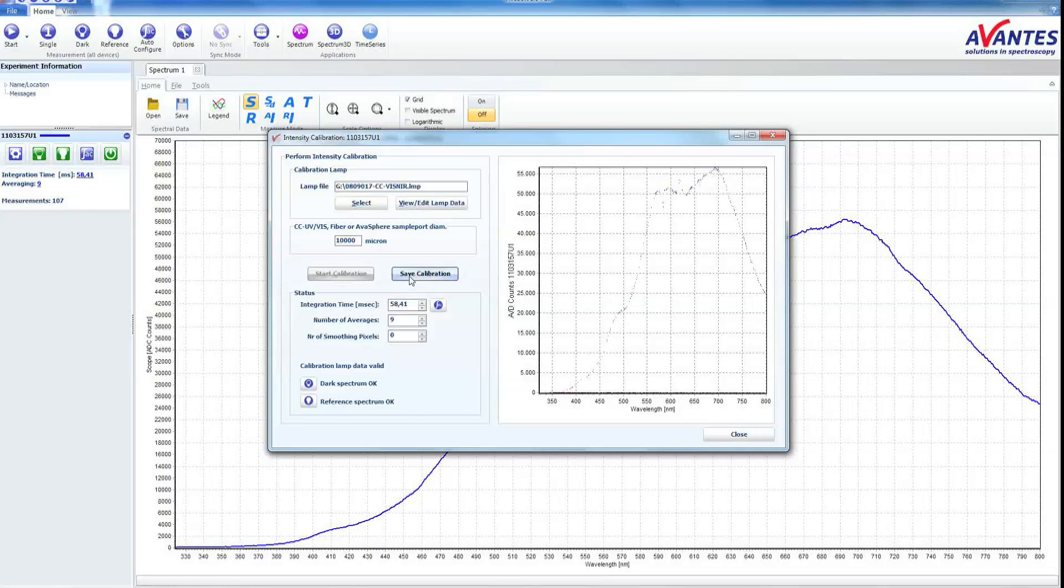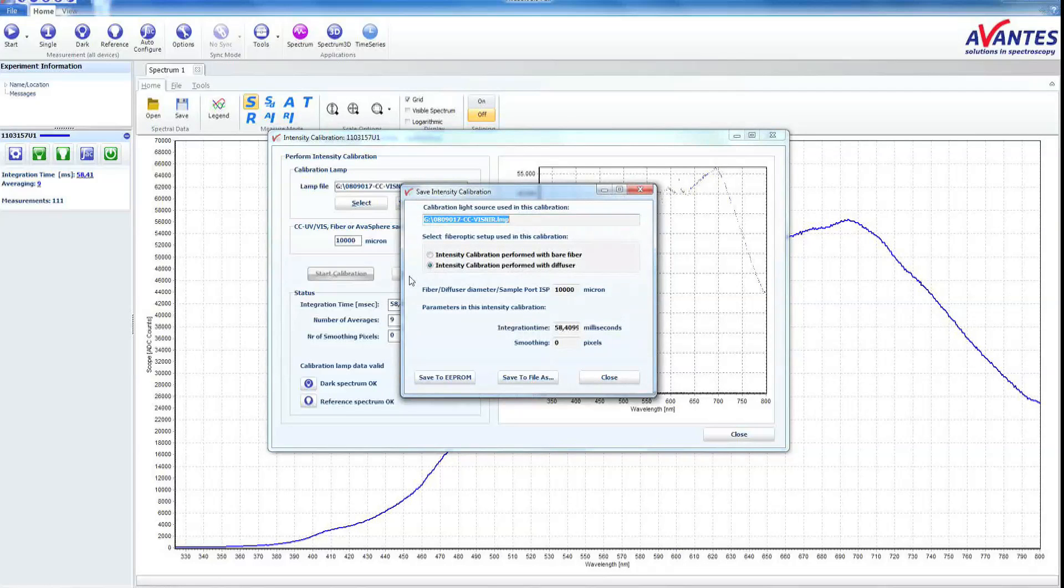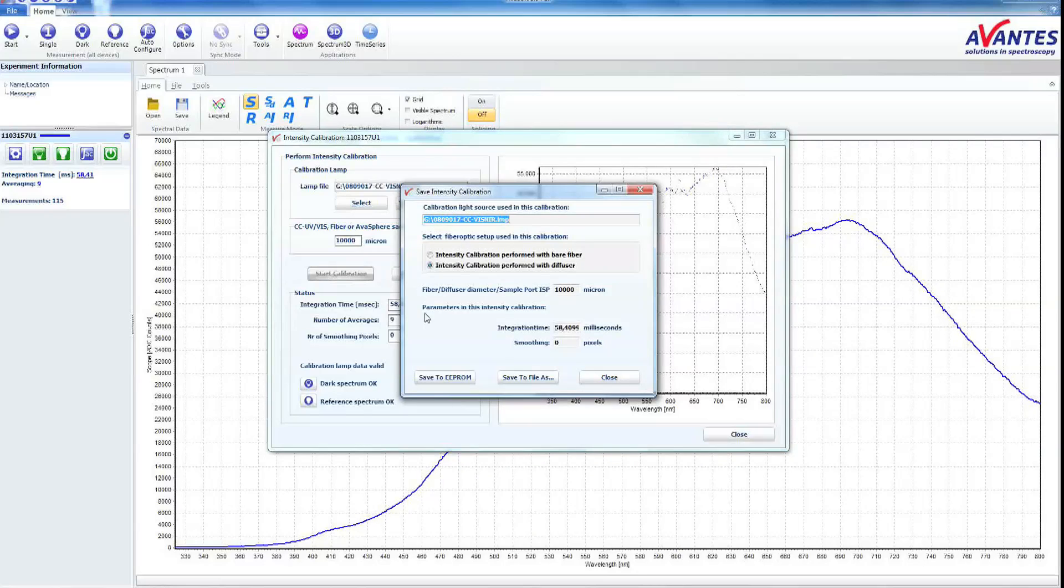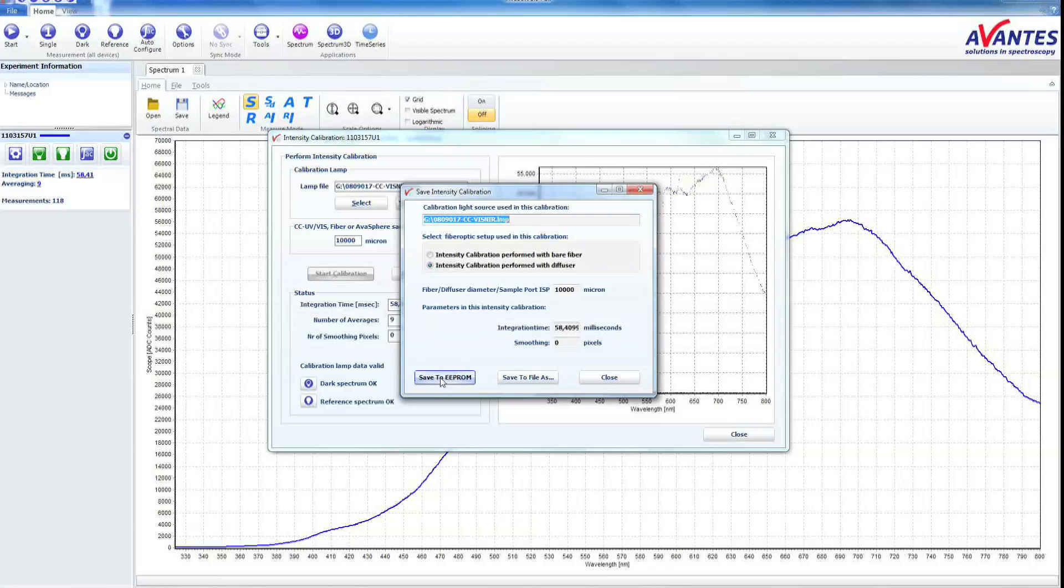Now you can save the calibration file by clicking Save Calibration. You can choose to save the calibration on the spectrometer or in the file. In this case, we will save the calibration to the spectrometer.